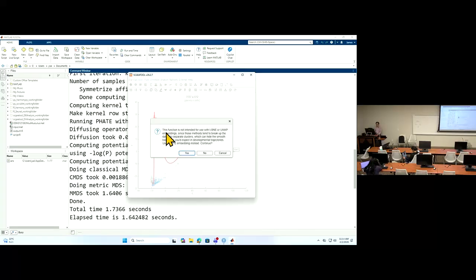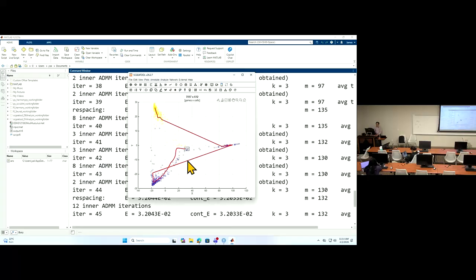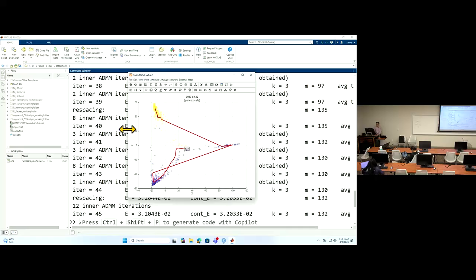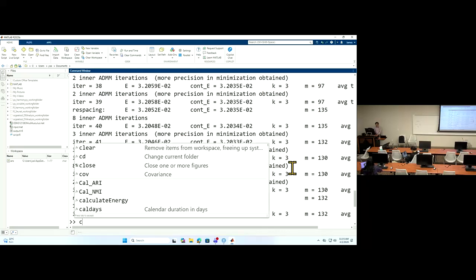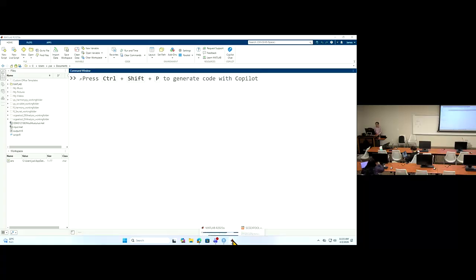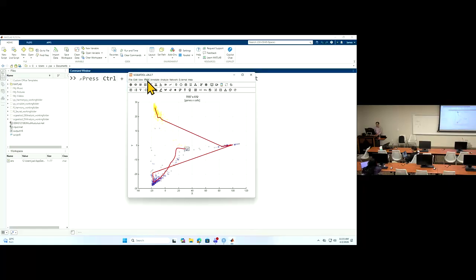Another way, if you do the principal curve, it just automatically draws a curve for you. This is not very good, especially given the sparsity of those cells. So those algorithms do not help. So we need a manual drawing. Okay.